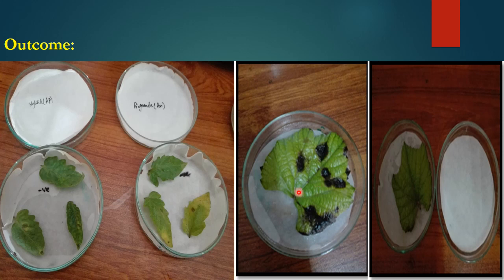The leaf detach method is a replica of the inoculation done on a whole plant. However, it is only acceptable and viable for pathogens which attack the aerial parts of the plant, especially the leaves. This method is not suitable for pathogens which attack underground parts — for example, pathogens that cause root rots — or those that target vascular tissue, such as wilt pathogens.